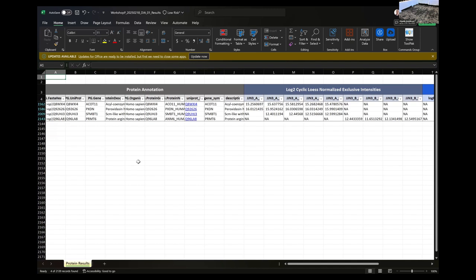You can look through the quality control data and make your own decision on how confident you are of how well the experiment went, because really you're sending off samples and sitting there waiting by the mailbox for these graphs to come back. You don't know if instruments were on fire, or we had a flood in the lab, or what happened. But when you see all these quality control missing value plots, you can piece together, okay, I have confidence in this. It looks like the experiment went well on my end, the sample prep went well.